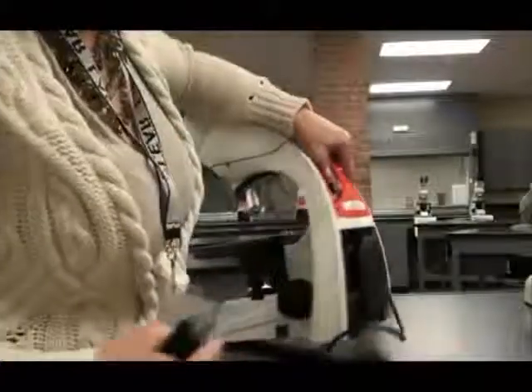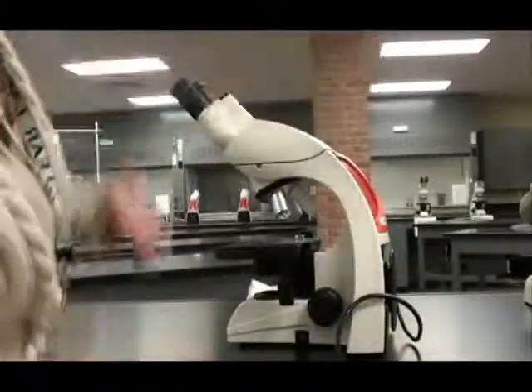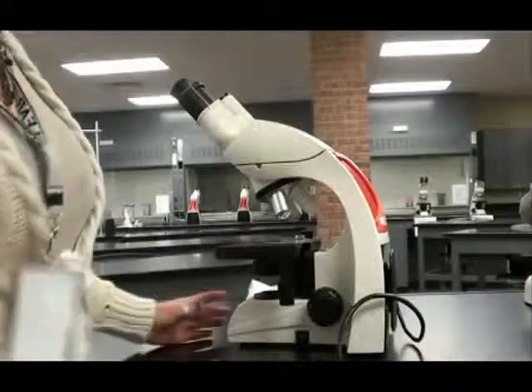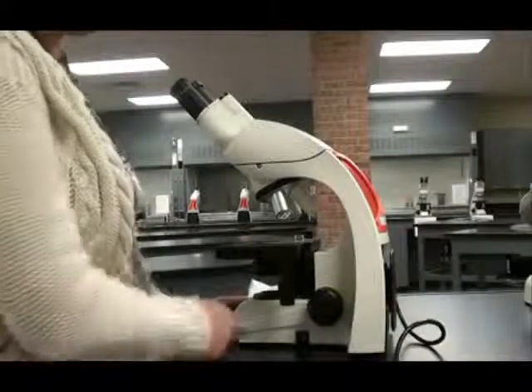Depending on the type of scope you have, you might need to plug a loose cord into both the scope and the outlet. Or if you have a scope similar to this, the cord is attached to the microscope, and you just need to unwind the cord and plug it into an outlet.